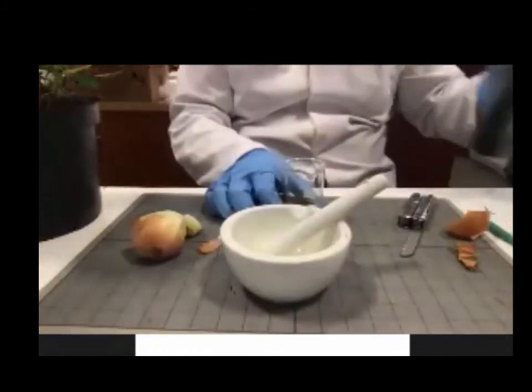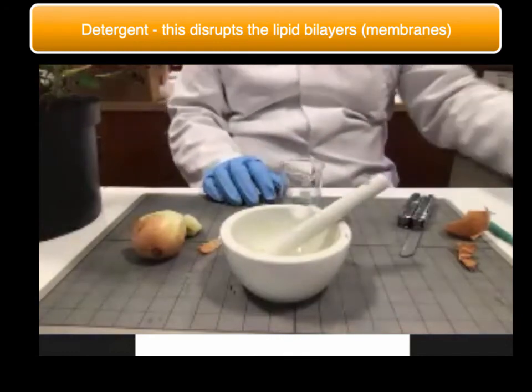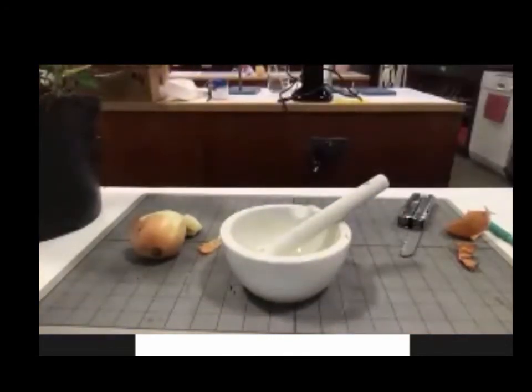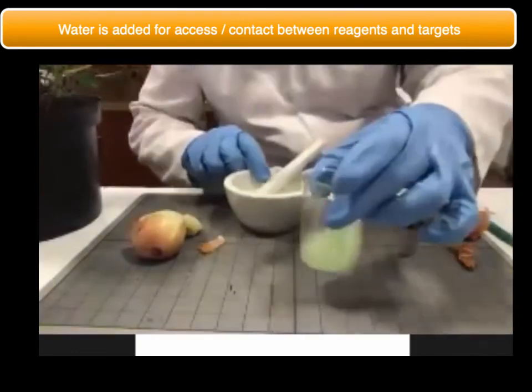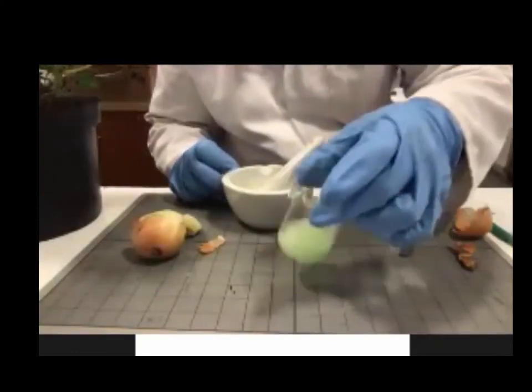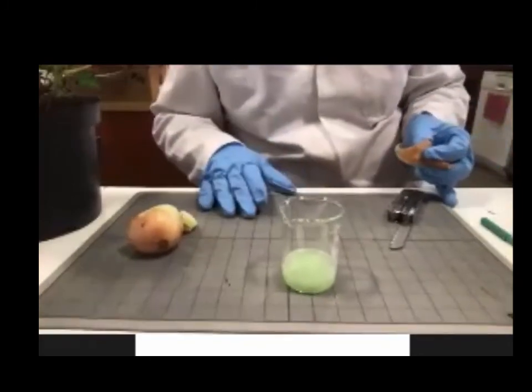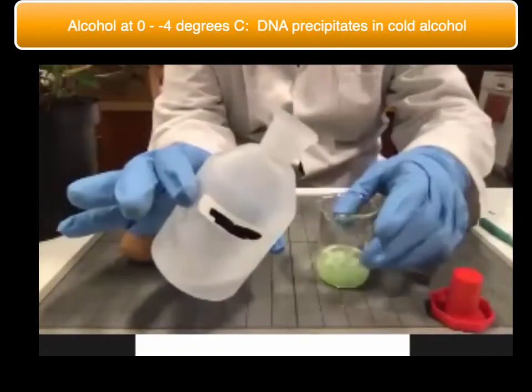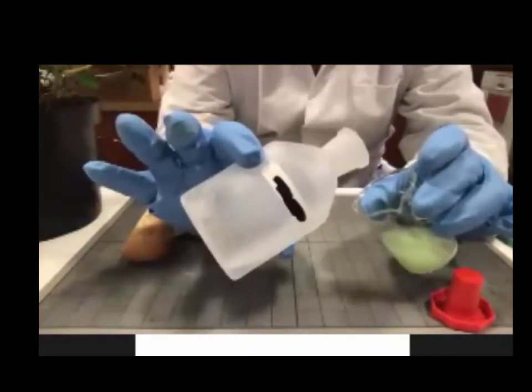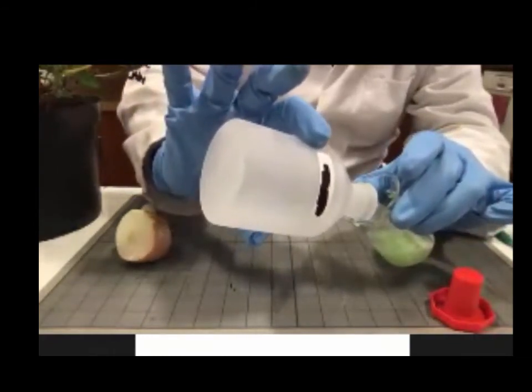Okay. Next thing I add is some washing up liquid. Add a spoon of that. Super. And then a little bit of water. Okay. Let's leave that to sit for a little while. And then, this is what I did earlier. I put some alcohol in the freezer. So this is alcohol that's been in the freezer, and it's neat. We've left that for a couple of minutes, and we drizzle that down the side.